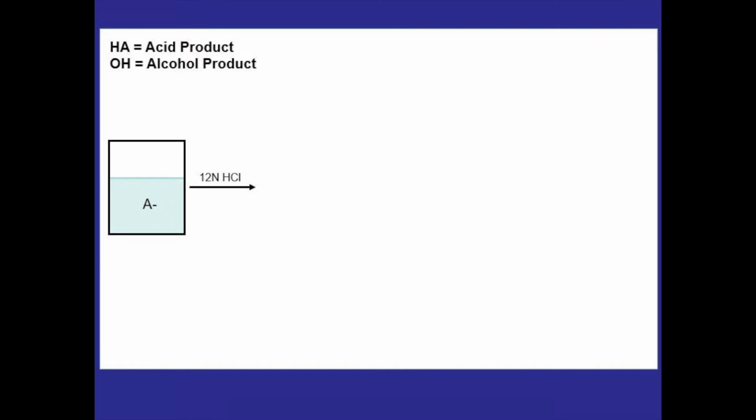As the hydrochloric acid is added, we'll see CO2 bubbles coming off as it reacts with the sodium bicarbonate, and eventually the unknown acid will precipitate out of solution as a white slurry, and we can test the pH of the solution to make sure that it is acidic. That way we can know that the unknown acid is fully neutralized.